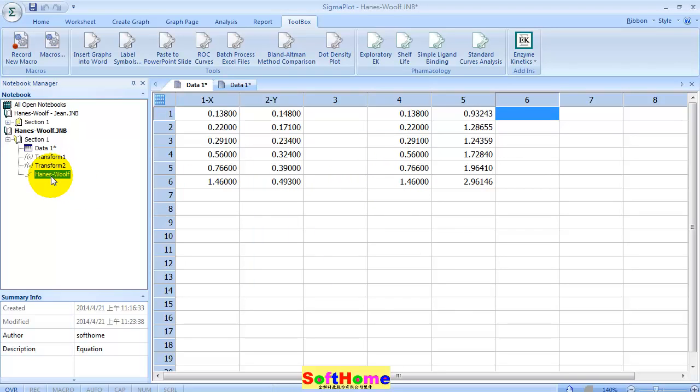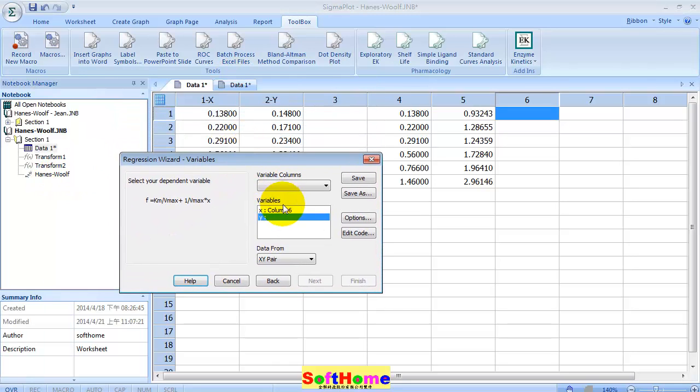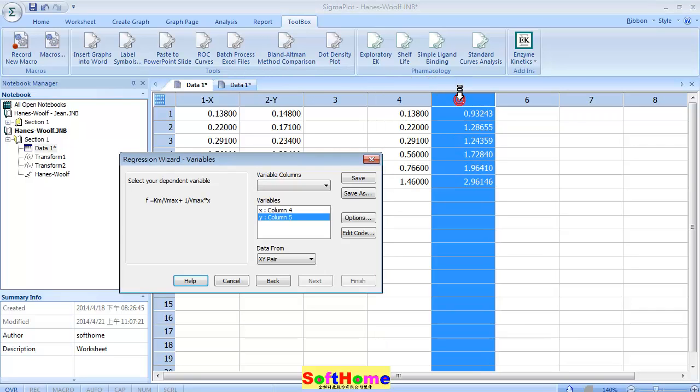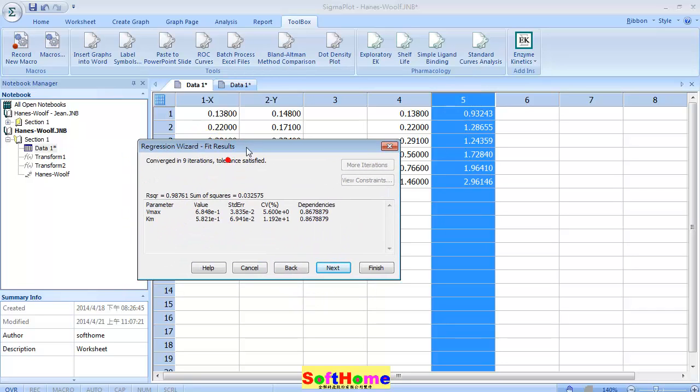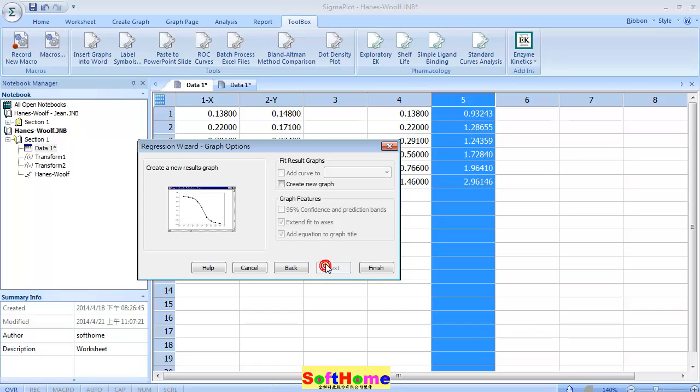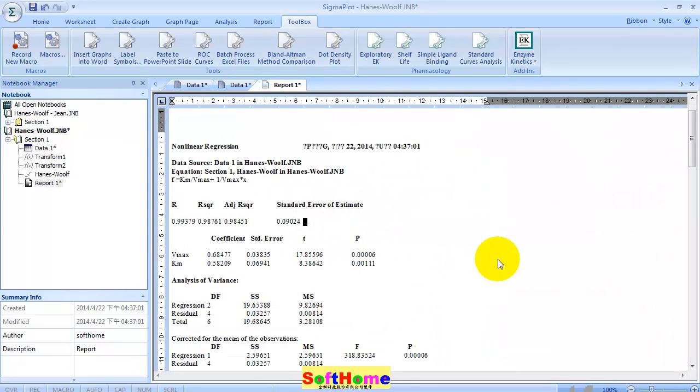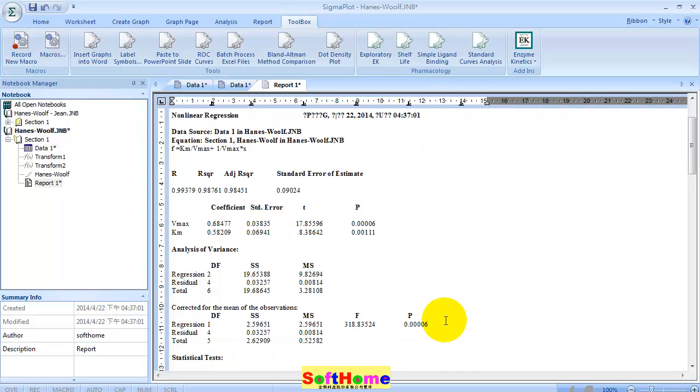Then press the user-defined regression. Please remember, X becomes column four and Y becomes column five. Press next. Now you can see the result. Press next and create report. Now you can see the report here. R square is here, Vmax coefficient and standard error, also Km, and you can find the p-value here.